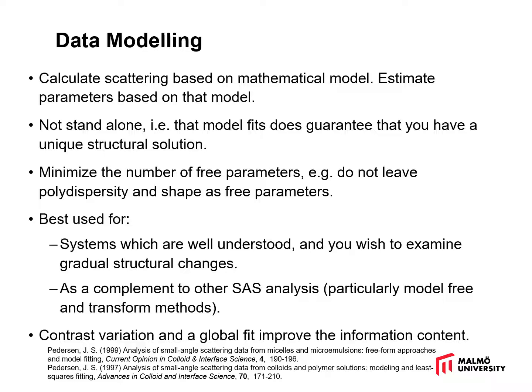It's important to realise that this is not a standalone technique for determining structure, i.e. that the model fits doesn't guarantee you have a unique structural solution. And in the approach, it's very important to minimise the number and the range of free parameters. A good example of this is not to leave the polydispersity and the shape as free parameters.